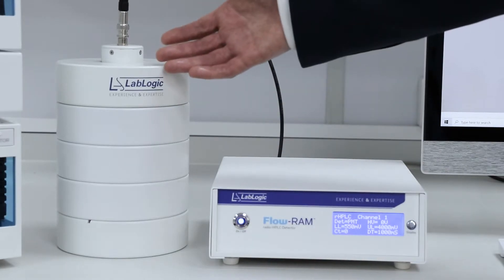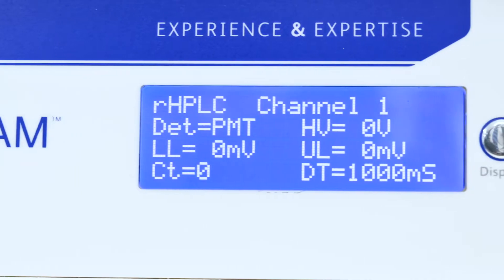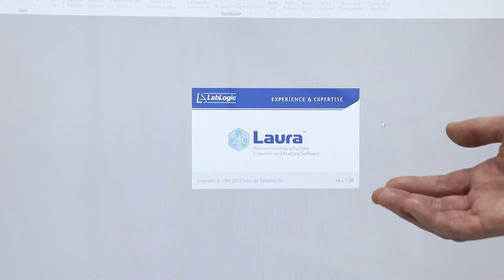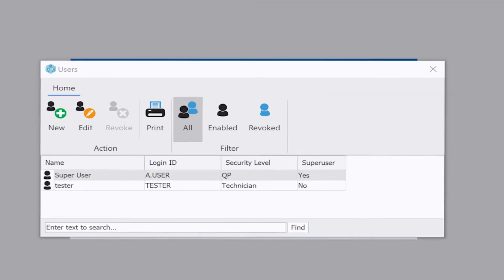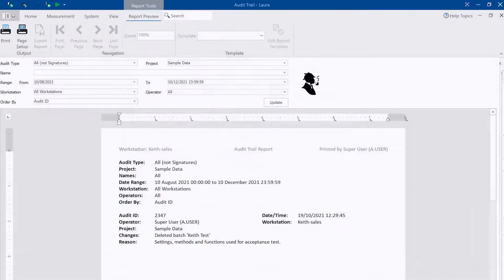The FlowRamp is comprised of an electronic box, a lead shield, and a detector. One key benefit of the system is that no operating parameters can be changed on the electronic box. The FlowRamp can only be controlled by our Laura for PET radio chromatography software. This ensures that only authorised users who have the appropriate level of access can make changes, with a full audit trail.